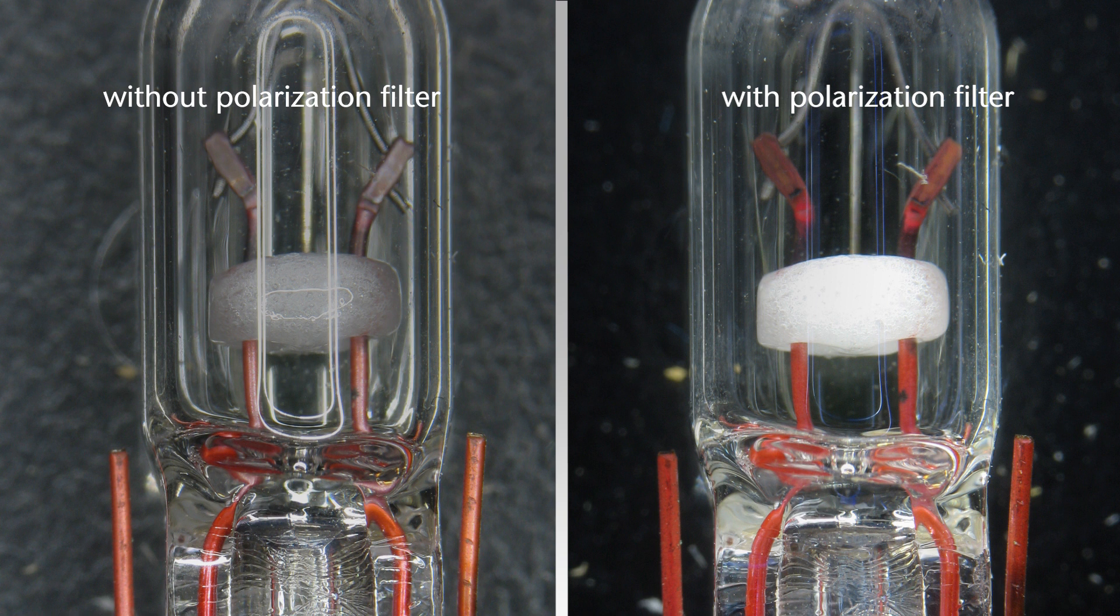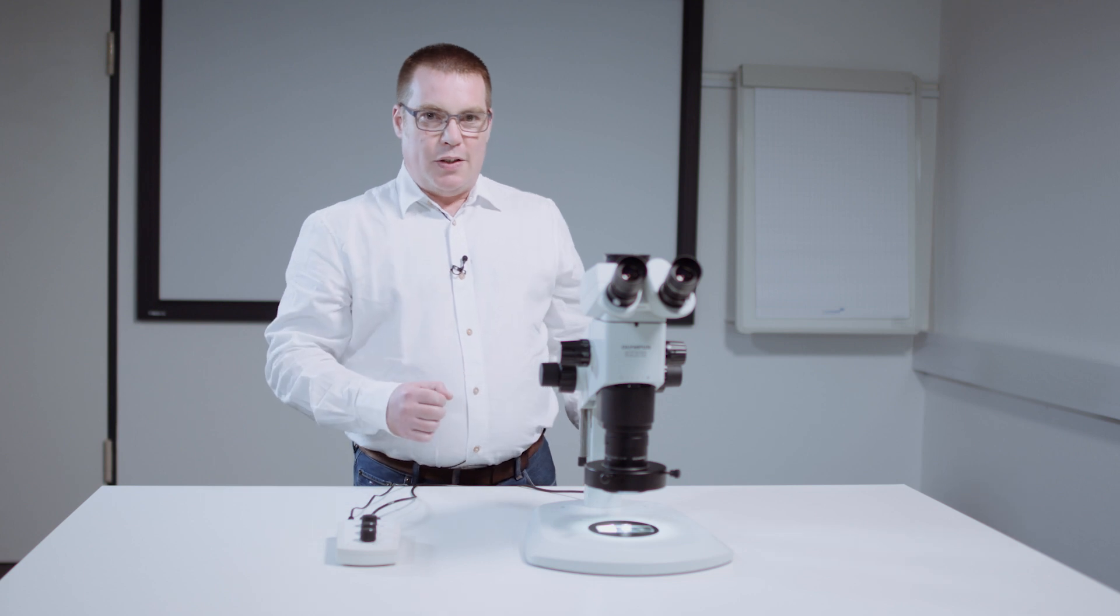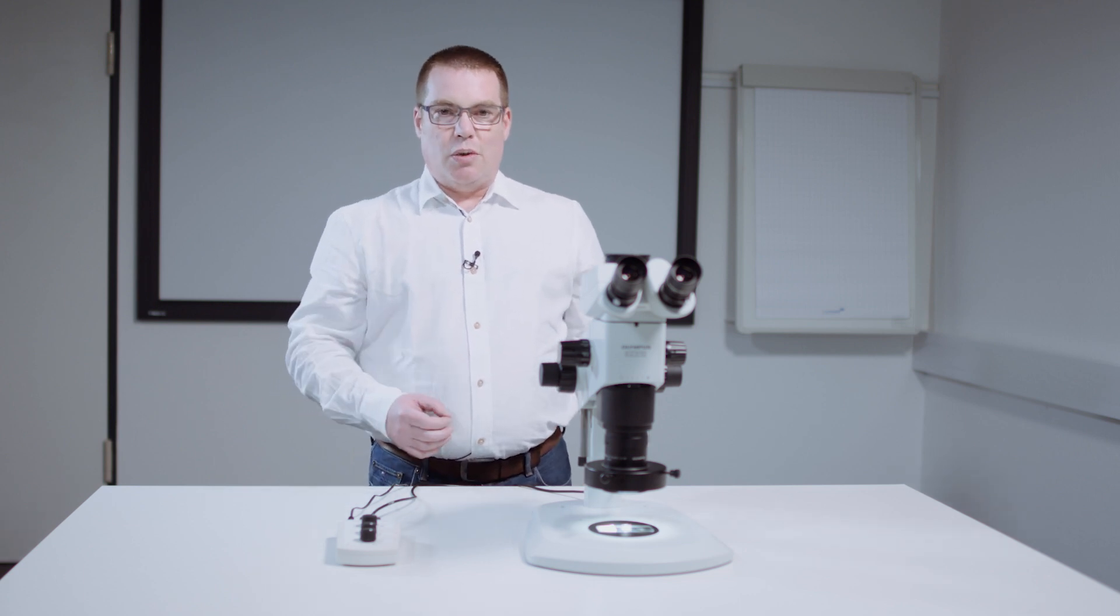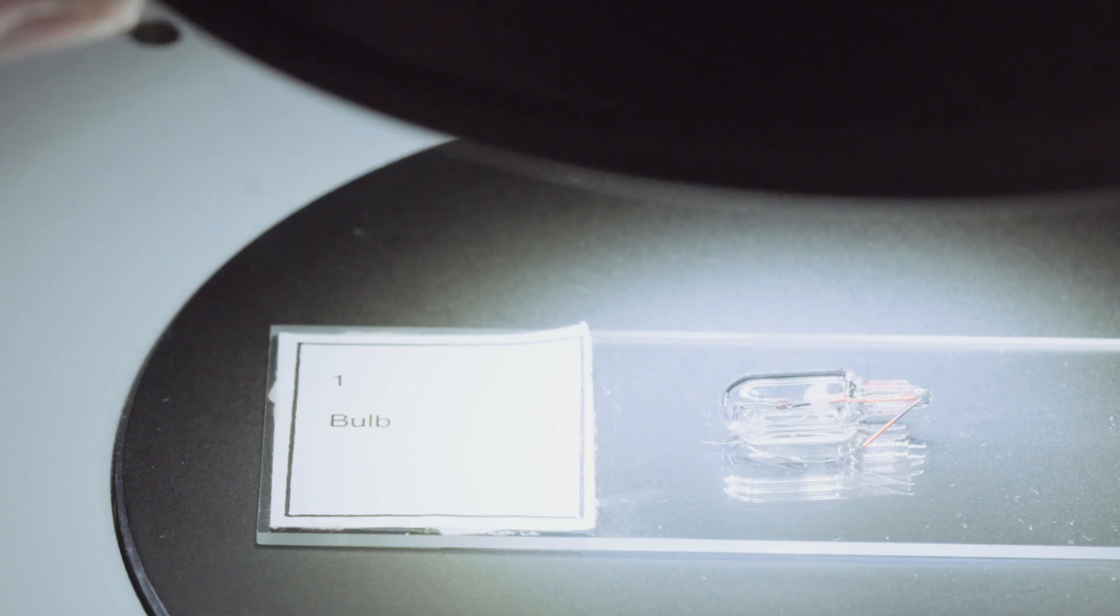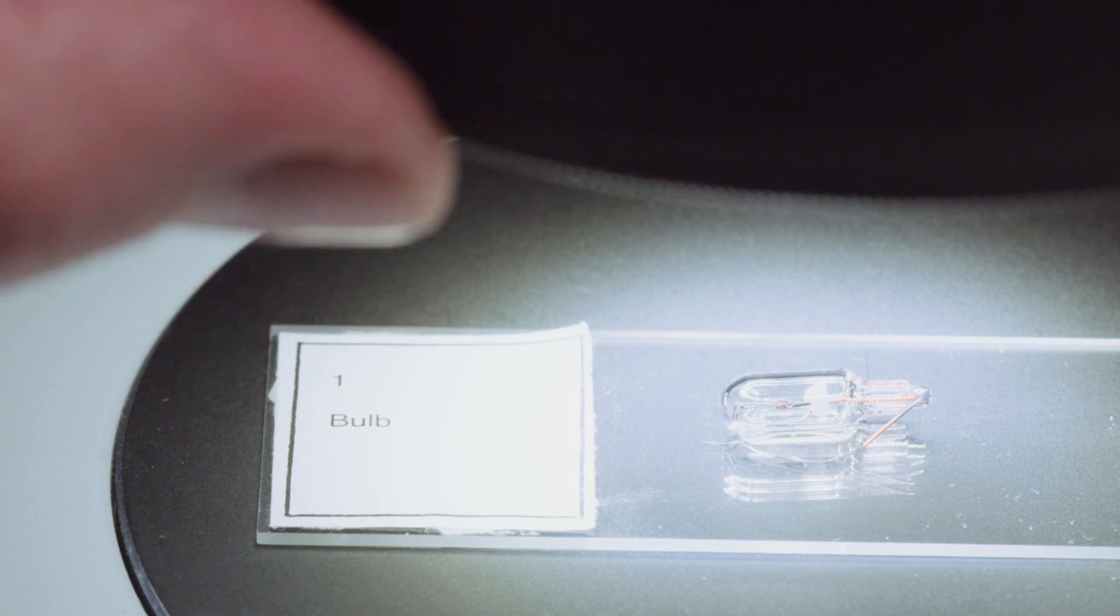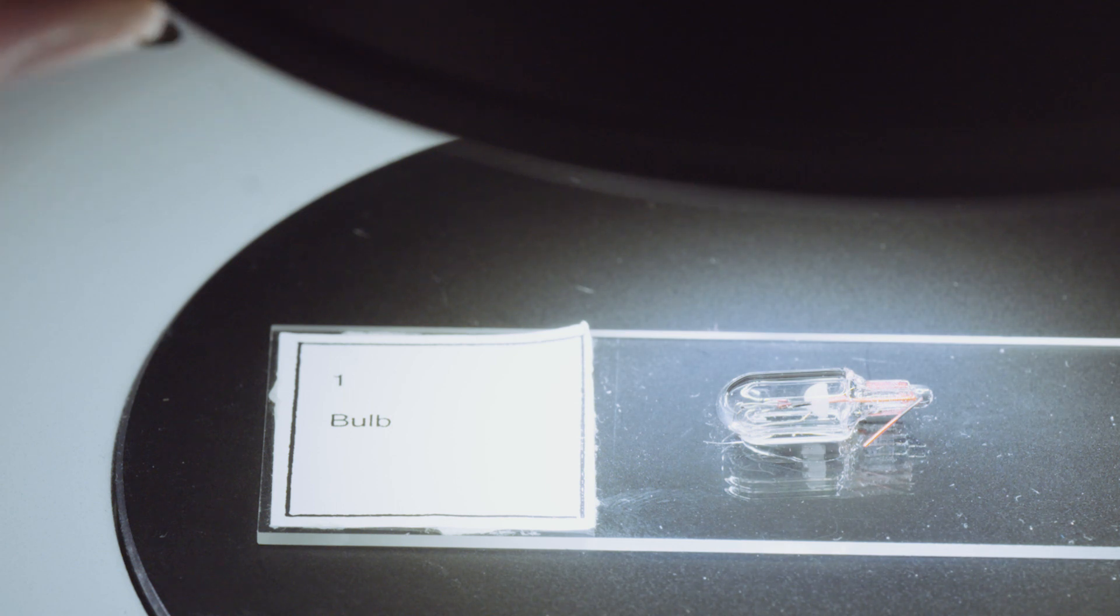In the conventional design, polarization filter sets are used that contain a fixed analyzer and a manually rotatable polarizer. Cross-polarization can thus be achieved by manually rotating the polarizer.